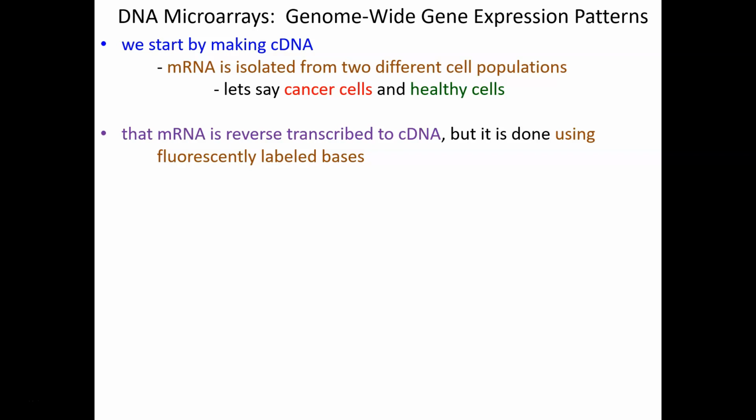By reverse transcription, we mean going against the flow of transcription. Transcription is copying DNA to RNA. Reverse transcription is copying RNA to DNA. We can do this using specific viral enzymes called reverse transcriptases. It doesn't naturally happen in most of the natural world, but a specific form of virus does do this, and we can leverage its enzymes and use these reverse transcriptases to do this.